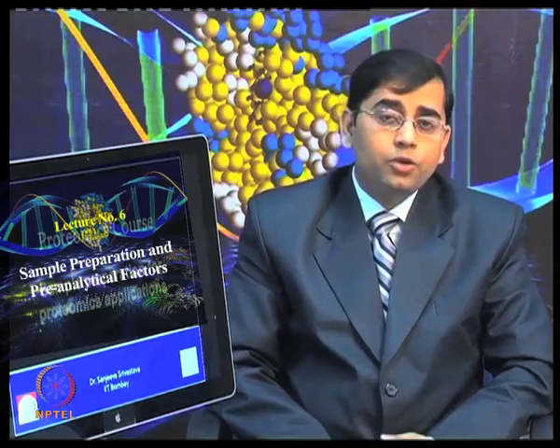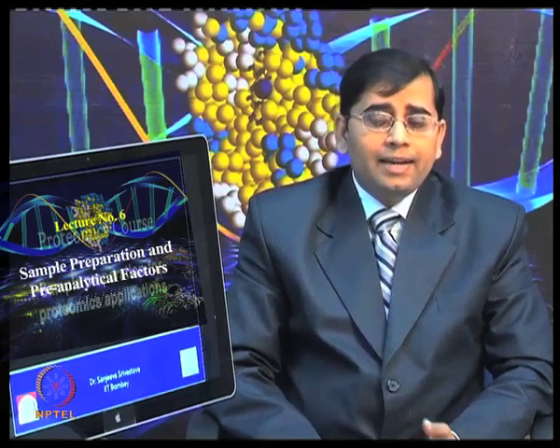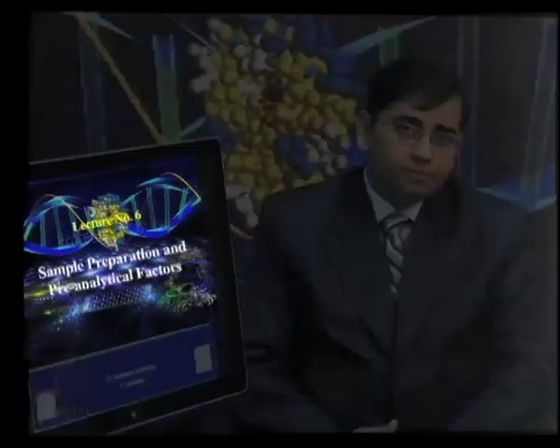Now, when you are performing a sample preparation, you have to be very cautious about what sample you are processing. You cannot follow a generic protocol. You have to optimize the conditions depending upon your sample. An ideal sample preparation will ensure that you have all the protein present in your sample without different types of contaminants such as nucleic acids, salts and other interfering components.